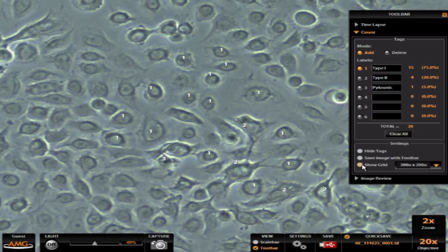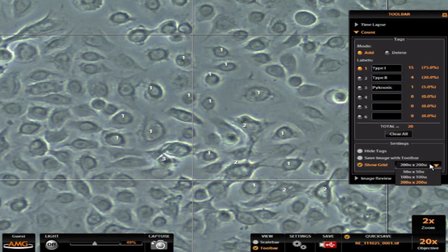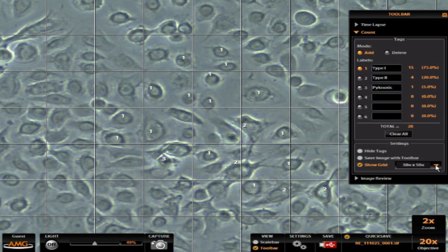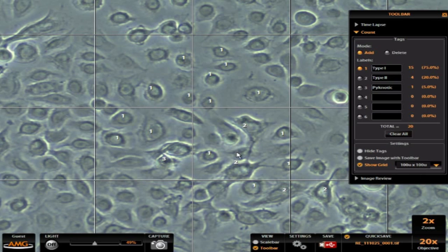Another thing that's handy is to turn on a grid. So this option that says show grid, I can turn this on. I can change the size of the grid and make it smaller or larger, count a certain number of cells within each grid and know how many cells I have per unit area.